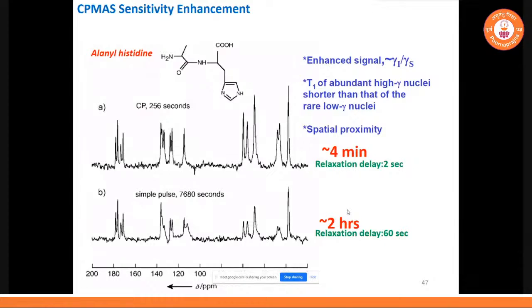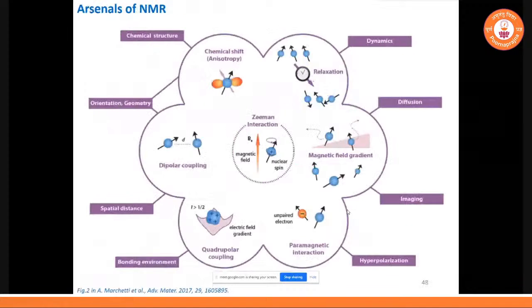So in solid state NMR, whenever you give a sample for analysis, the first thing they will do is cross polarization and MAS. That means the cross polarization magic angle spinning experiment. So we get high resolution lines as well as sensitivity enhancement. This is the bread and butter for solid state. This is the first sequence you give for sample analysis in solid state, be it carbon or nitrogen or whatever. So I will stop here for solid states. These are the overall picture of solution NMR and solid state NMR. Now we'll go towards applications. I'll take some 5 or 10 minutes here and then I'll finish.